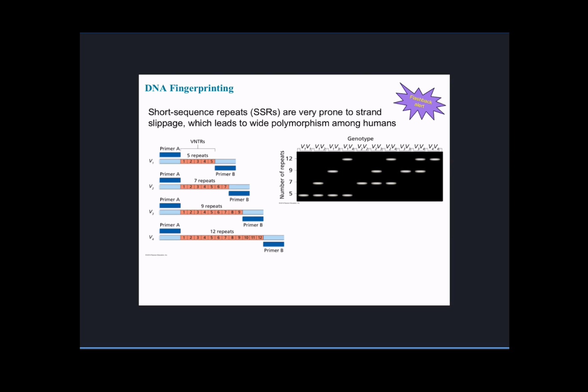We would take a sample of their blood, saliva, whatever sample we may have of them. We subject those samples to PCRs with these very special pairs of primers, and then we get typically 2 bands in these gels that will tell us what V numbers they are, right? And from there, we can build pedigrees, or we can do the paternity test, or whatever we need to do.